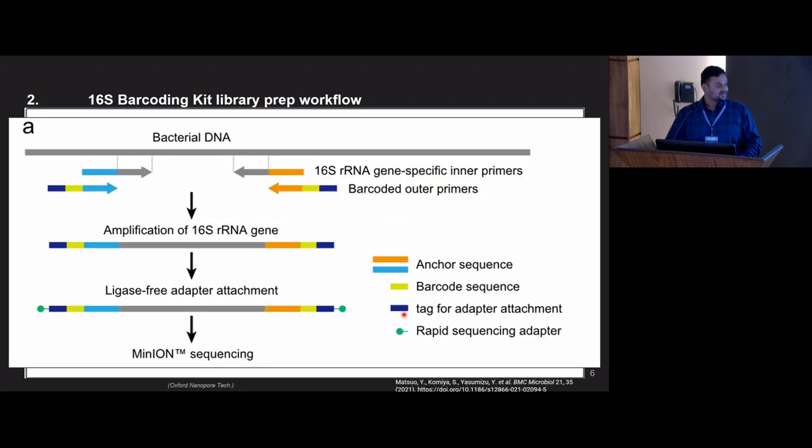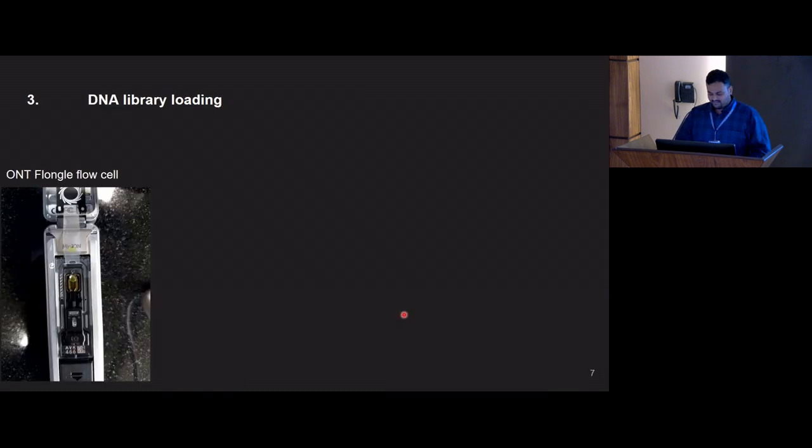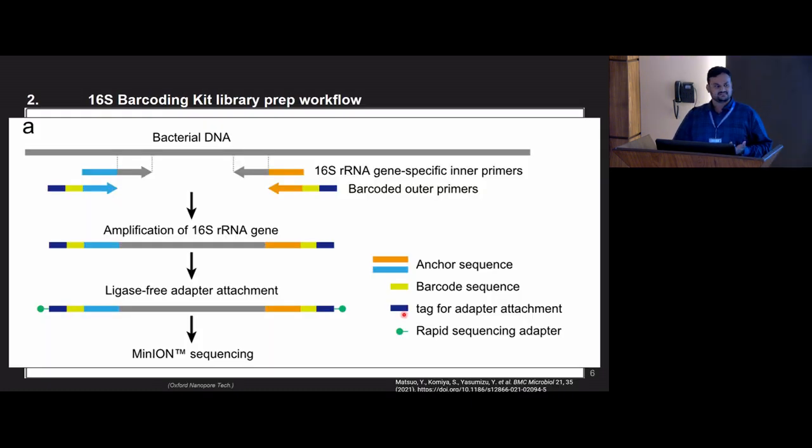And this is just another easy schematic for the same. Any questions here? Because this is a very simplistic, brief overview anyway. This is amplicon. This is 16S amplicon, because you already know which region you want to focus on in all the genomes. If you didn't know the region, then you would have chosen shotgun. Absolutely. But then again, this is nanopore, so shotgun does not really apply here.